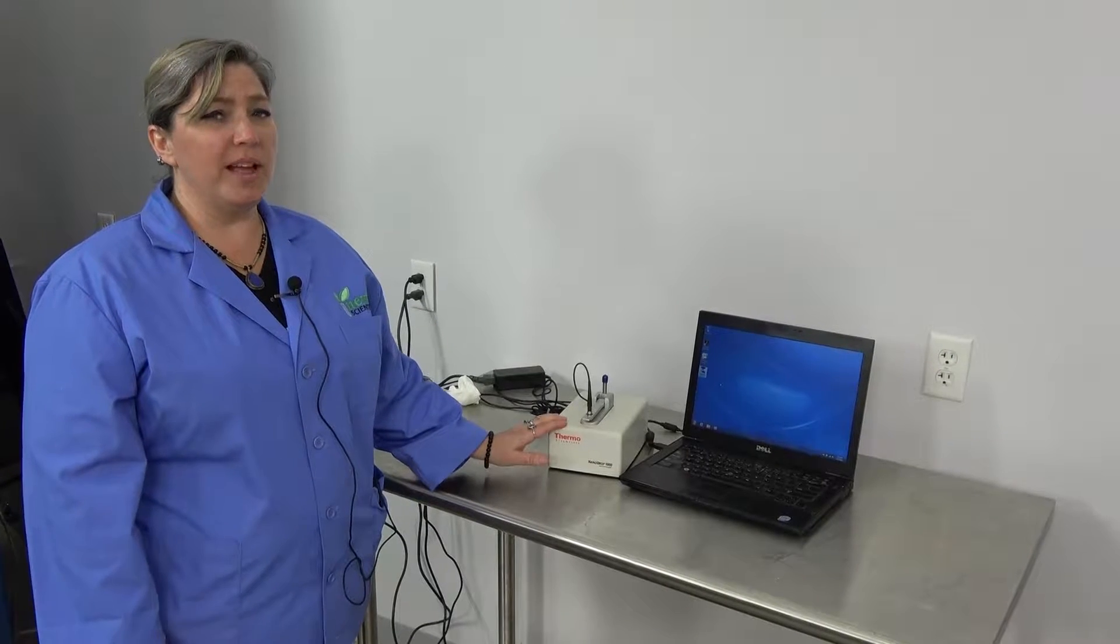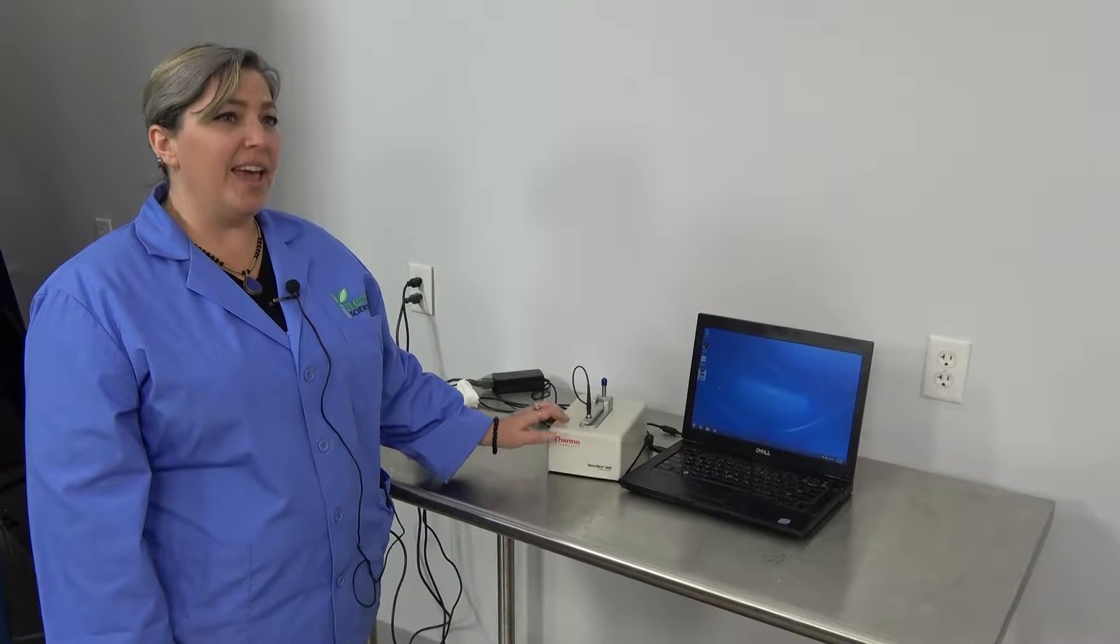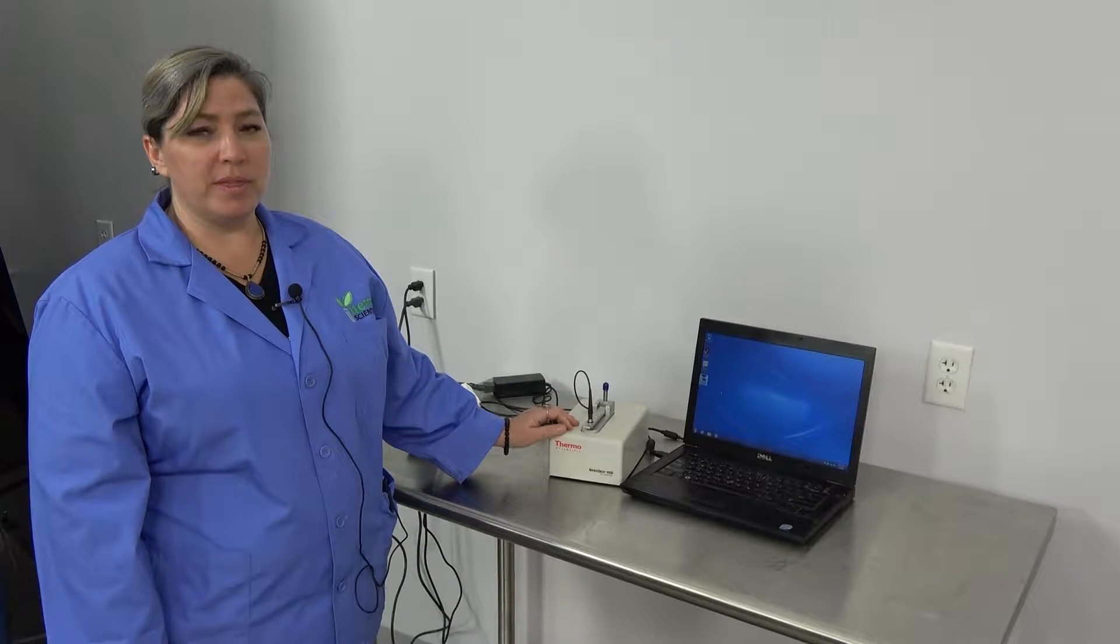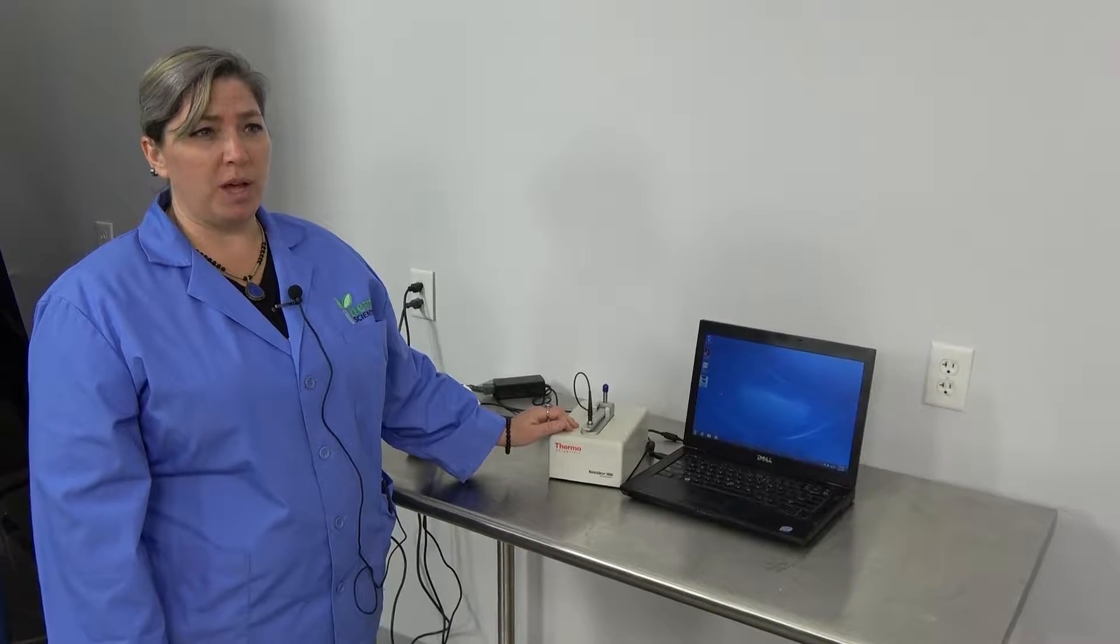Hi, I'm Lori, and we're at New Life Scientific, and this is the NanoDrop 1000 Spectrophotometer.